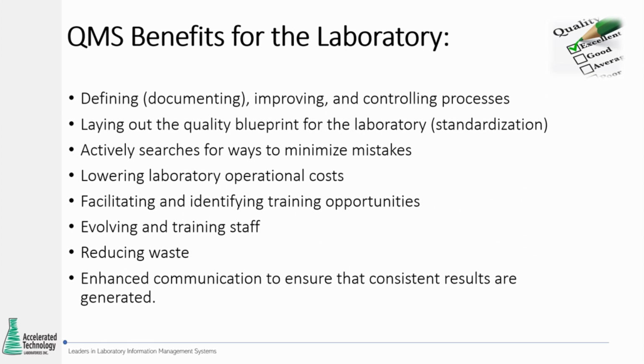Now, there are also numerous benefits of the QMS for the laboratory. First of all, document control. Defining, documenting standard operating procedures, controlling them, controlling processes. Also, it's standardization. It really enforces standardization across the organization because everyone's basically looking at the same standard operating procedure and following it. And you're also looking for ways to minimize risks.